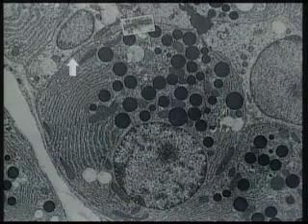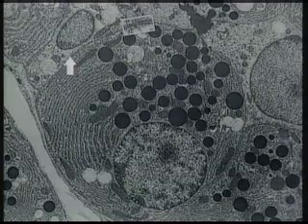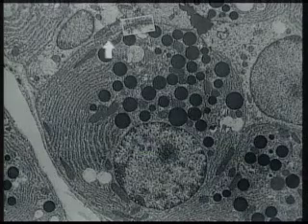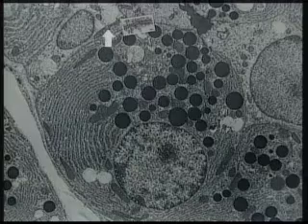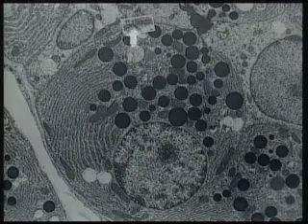Now this little thin line is the cell membrane, which is the outer limit of the cell, and it's shown at higher magnification here, and what we see here really are two cell membranes, one from this cell here and one from the cell above it, that are next to each other, and between them is the so-called intercellular space. Now in the next image we'll look at this at higher magnification. Here the electron microscope shows us two cell membranes next to each other with the intervening intercellular space.